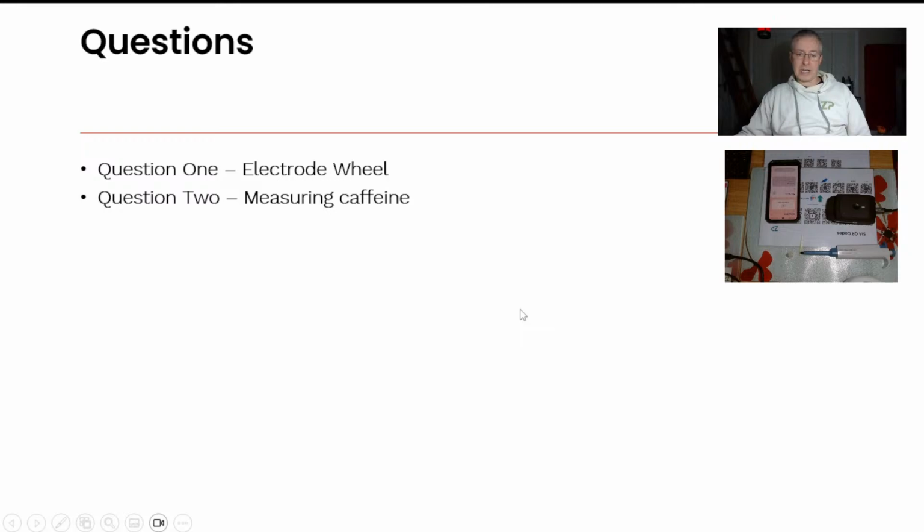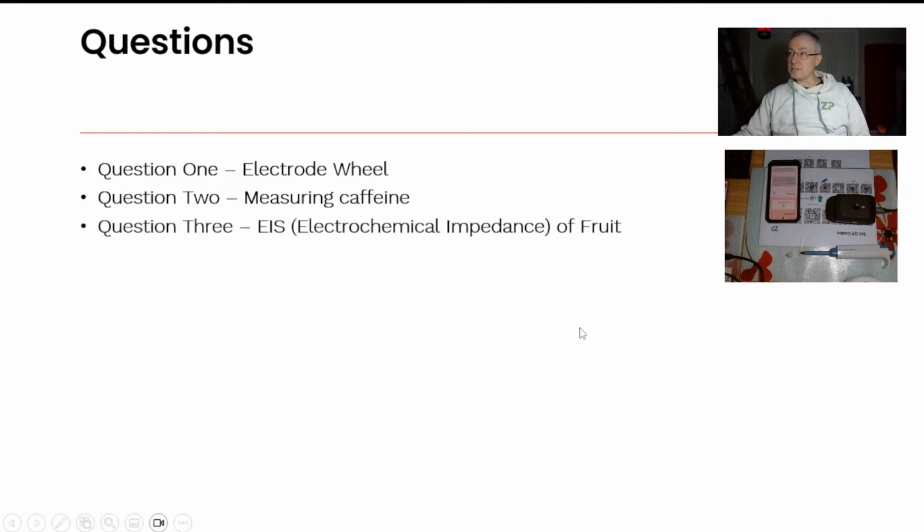I'll also talk about measuring caffeine. This is an important one to me because often on this channel I say one of the biggest problems in academic translation or startups is the reproducibility of screen printed electrodes, and this shows that we are actually getting good reproducibility. I also have a contact, I think in Hungary, who often reaches out to me with questions around EIS, impedance spectroscopy. They sent me something fun about the impedance spectroscopy of fruit. I'll only mention that very briefly.